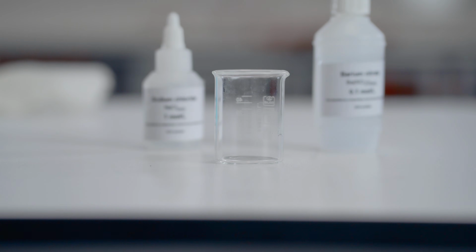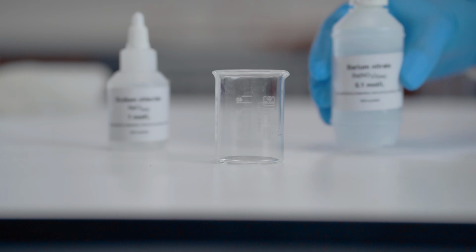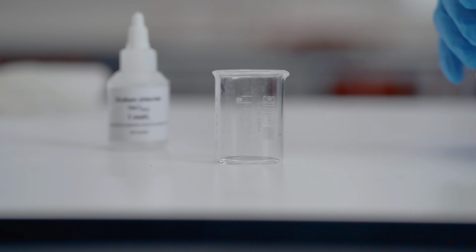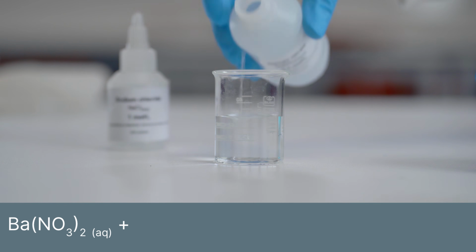Okay, this one here, our last demonstration, is going to be a combination between barium nitrate and sodium chloride. Hopefully there's enough solution here for it to work. Now, I've got a feeling this one here is probably going to be a white colour. So if that's the case, I'm just going to add the barium nitrate now, and you can see that's very much like water, completely transparent.